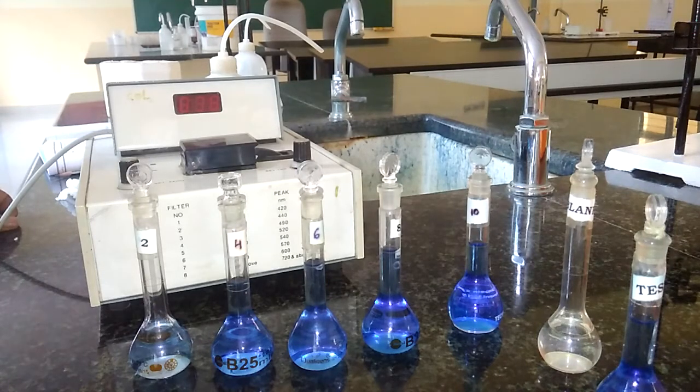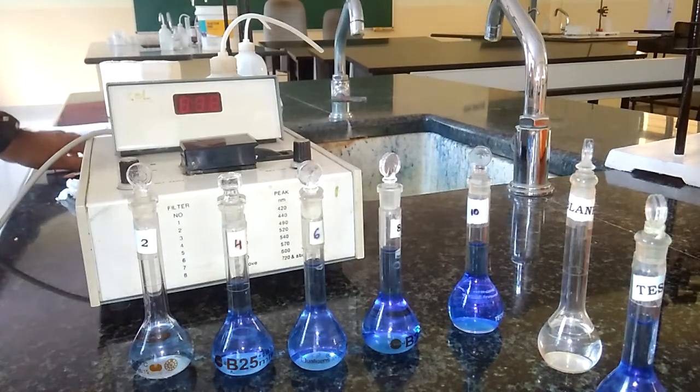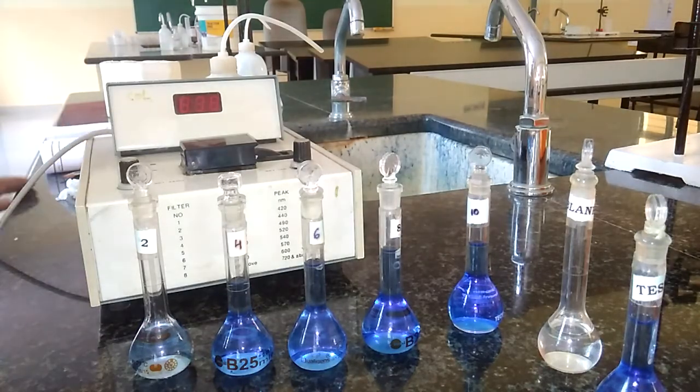Today, I am going to give you the demonstration of a colorimetric experiment. The title of the experiment is colorimetric estimation of copper in copper sulfate. For this, we need some of the devices and chemicals.